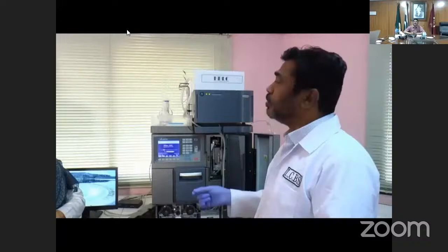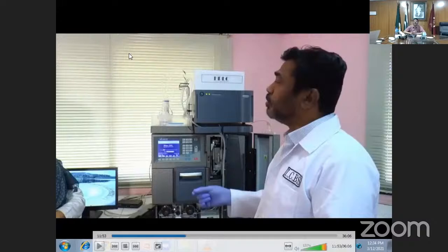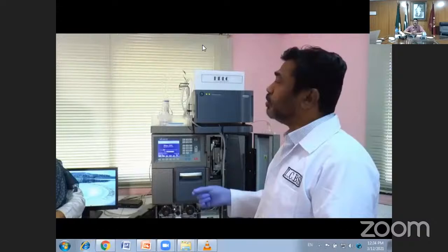So in this presentation, I try to explain how the Waters HPLC is working, how people are using analytical HPLC. If you have an analytical machine, you have a detector, you have pumps, you have a heater. Sometimes the heater is not an essential part, but if the analysis is temperature sensitive, then at that time the heater is necessary.